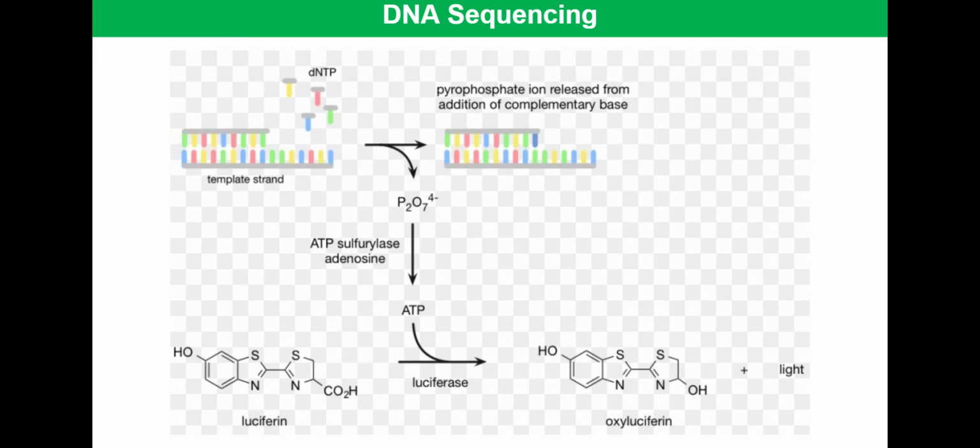One million reads occur simultaneously, so a 10-hour run generates 400 million bases of sequencing information. Software packages assemble these sequences into longer sequences.